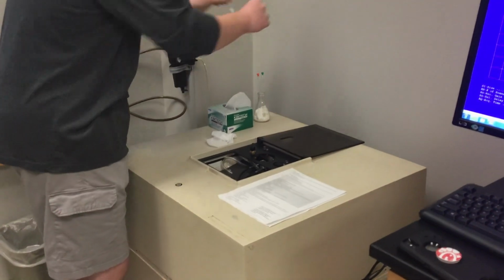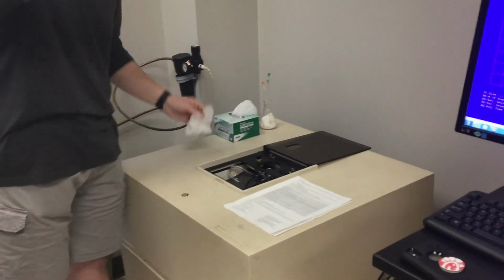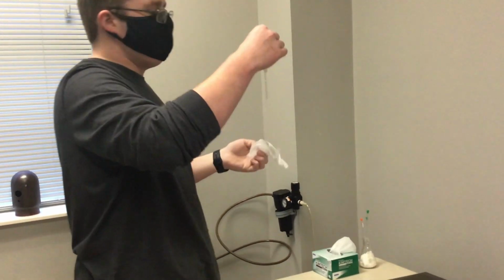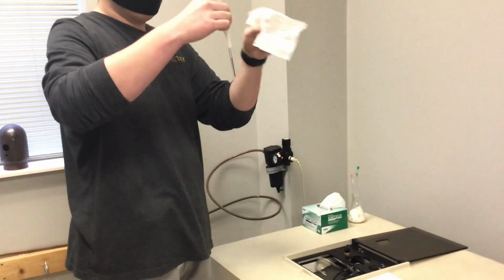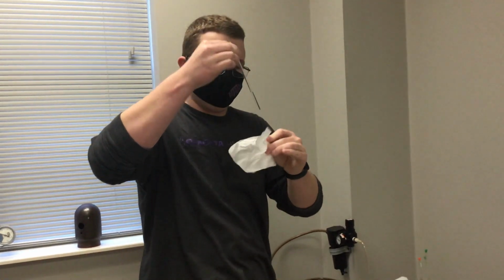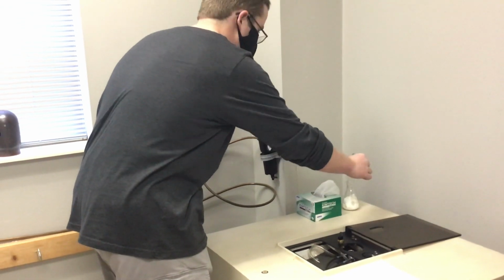But when we're working with this, the biggest thing you need to worry about is you don't want to touch this plastic spindle with your fingers. It'll get oil on it and mess it up. So what you need to do is pull a Chemwipe and just grab it on the sides and slide it off the tube. Not hard, pretty easy to do. Just don't pull it too hard. If you're expecting something big, it's not that bad.